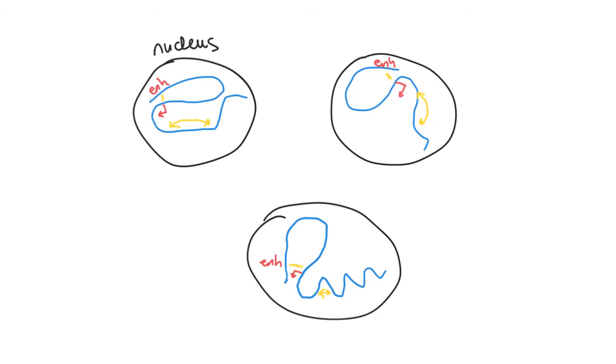And that's another way to identify potential enhancers of genes: we look for regions that are statistically associated with each other more frequently than we would expect by chance. And if one of those regions is a gene, then it's likely that the other region is an enhancer that regulates it.